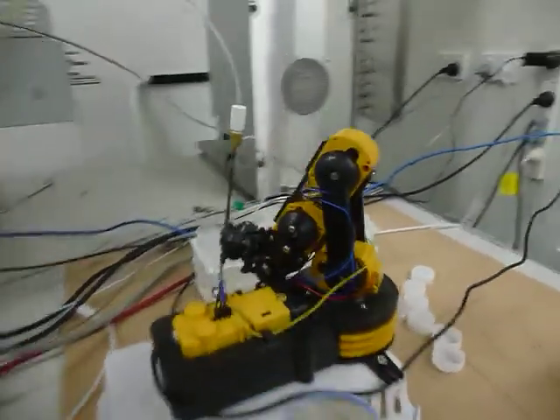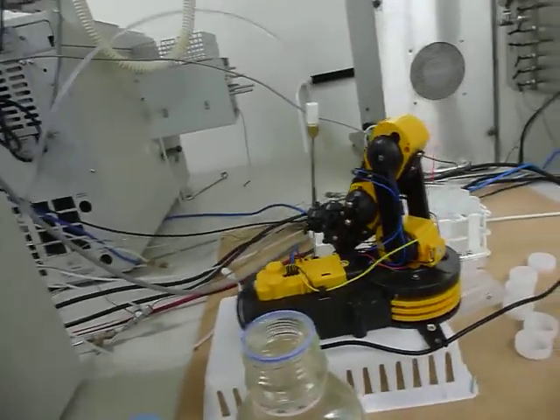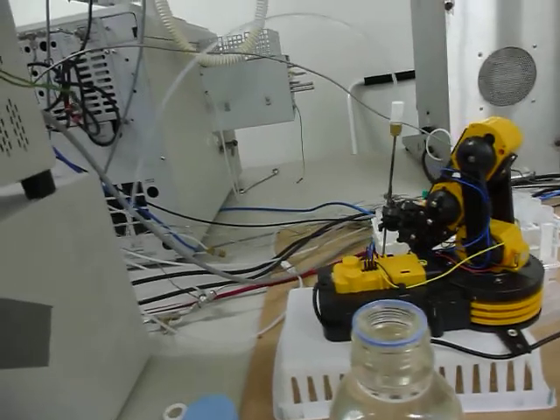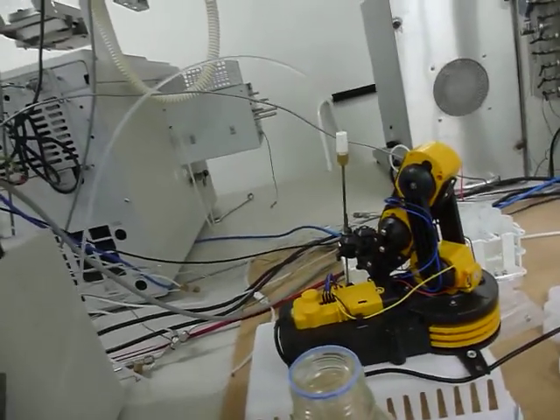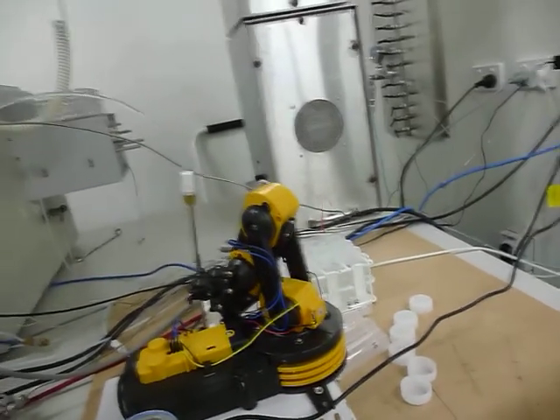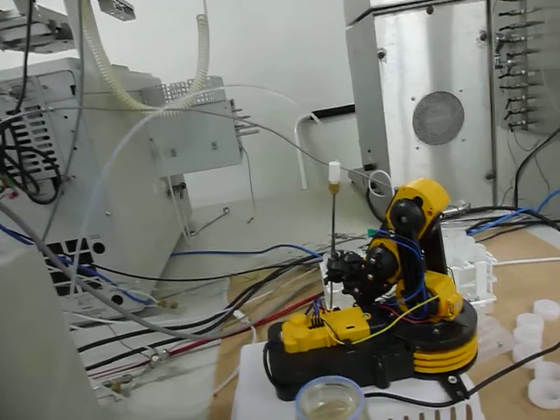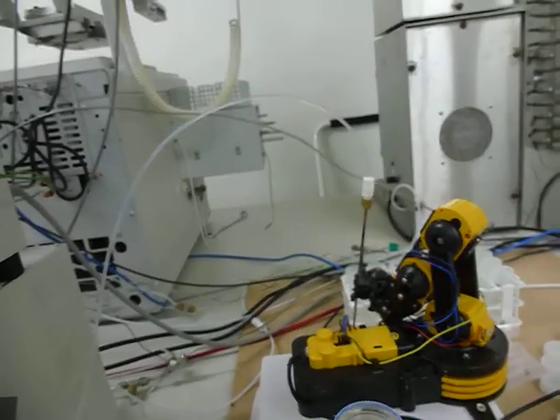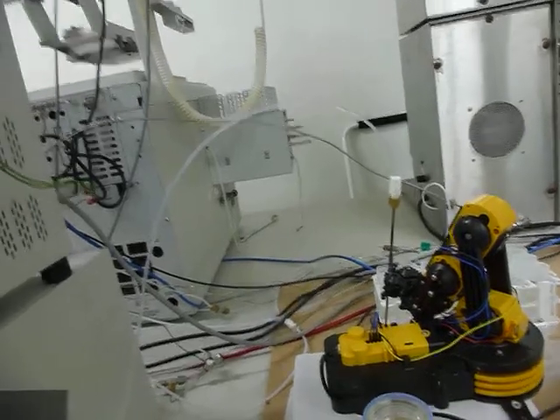I drilled those holes and put the wire on the positions that the batteries would go. Then I also removed the claw, so I can show you here the claw of the robotic arm that I got out. The claw was quite weak. This is the claw. I don't use it because it's not necessary for this purpose here.